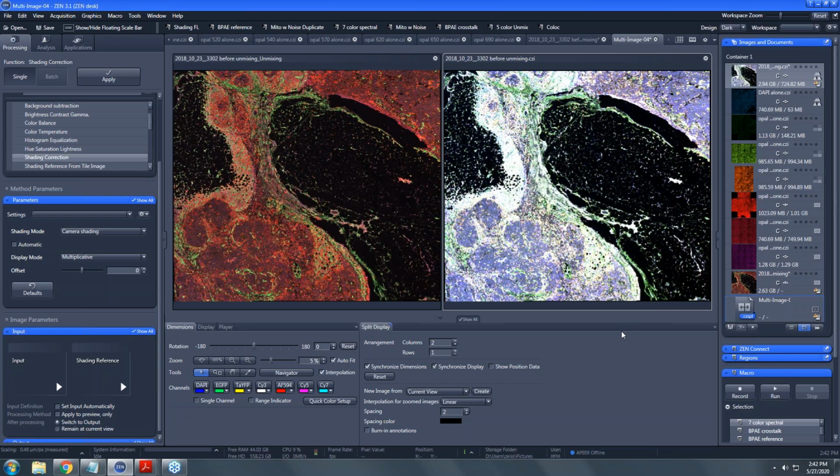Okay. Very good. So it certainly is possible. I think we've seen data sets up to 10 fluorophores on a laser scanning confocal. This was done on a wide field system. It was done on a whole slide scanner, so it's certainly possible. I think the 10 fluorophore solution that I saw was done on a 980 that had a spectral detector. So it gives you a much faster and easier way to acquire spectral information. Not to say you couldn't do it with a camera-based system, but it's a little nicer workflow with the LSM.